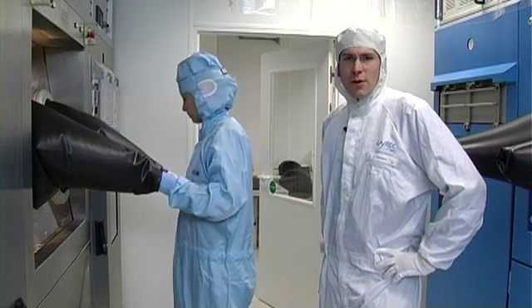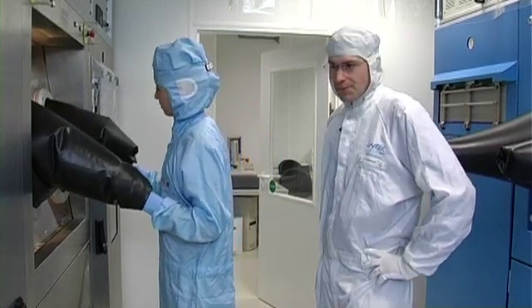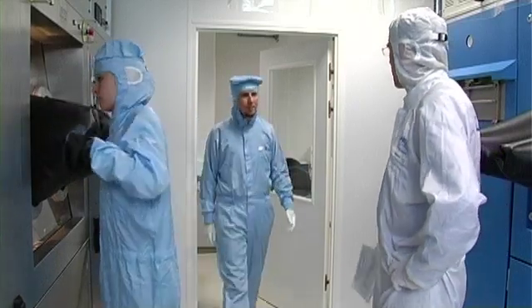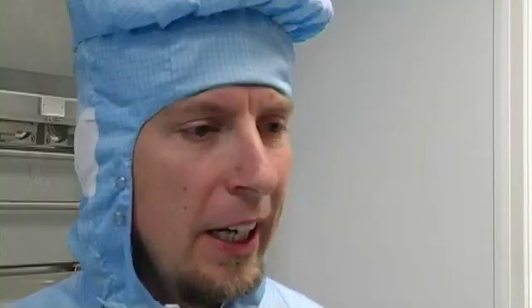Now we can see how the reactor is prepared for the next run. Here comes Dr. Frank Brunner. Hello, Kolja. Hi, Frank. In this run, we're going to load 8 wafers simultaneously and to view the loading procedure, let's go to the other side. Okay, good idea.